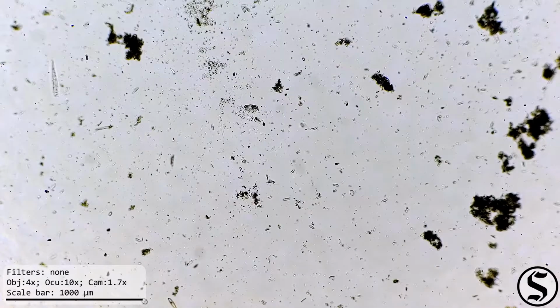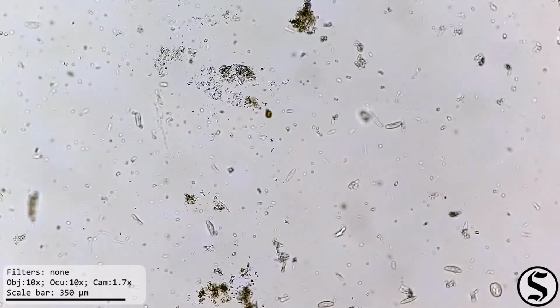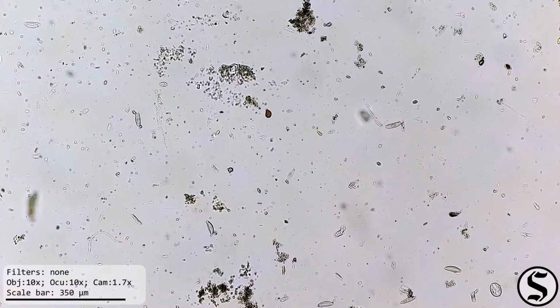Under the microscope, we can see we've definitely got some movement. Look at those little things. They seem to sort of go forward and bounce and then go forward again.